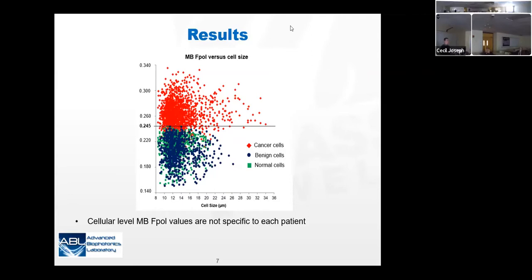What is the actual concentration of methylene blue which you apply? So you made a protocol for this, optimized for thyroid cells? That's a great question. The staining concentration was 0.05 milligram per milliliter methylene blue. The actual concentration in the cell environment would vary; we never measured it.